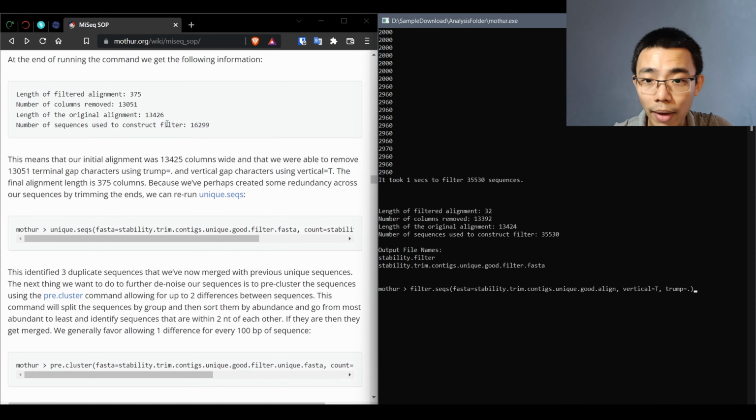Just in case you're wondering why there's so much output, Chimera vSearch is actually not a mothur native program. It adapts vSearch from some other previously written program, which is why the output and the programs are slightly different, and it's also why it's called Chimera vSearch. So they actually adapted it from some other people.